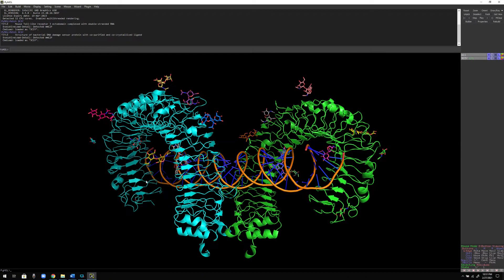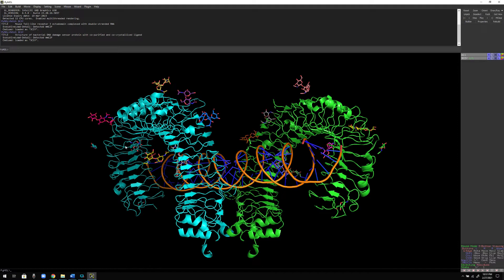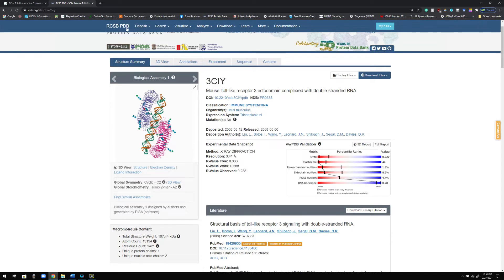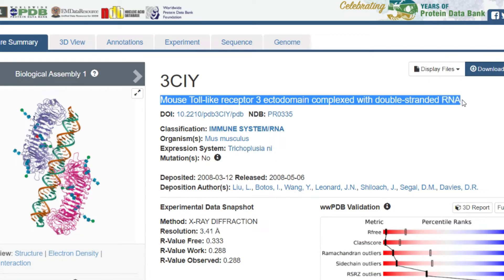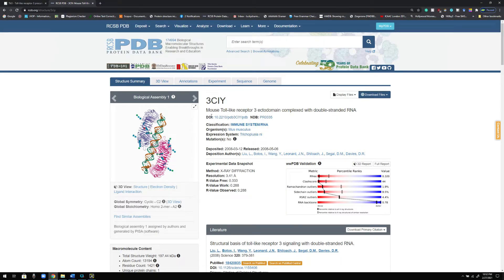Let me first go to the website of the Protein Data Bank, and then we'll discuss the structure that I'm processing today. As you can see, this is the structure, and I'm also going to show you the same thing using UniProt. Here I am at this specific page — this is the structure that I am trying to analyze using PyMOL and trying to extract the FASTA sequence. This structure is mouse Toll-like receptor 3 ectodomain complex with double-stranded RNA.